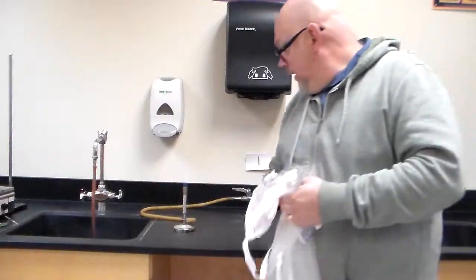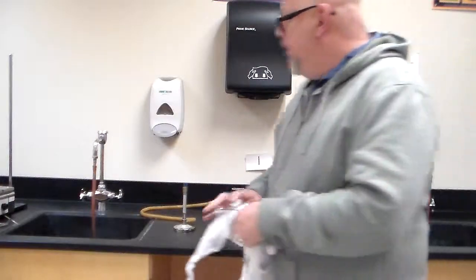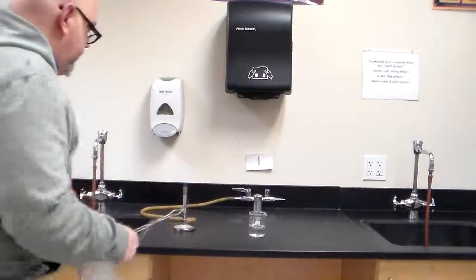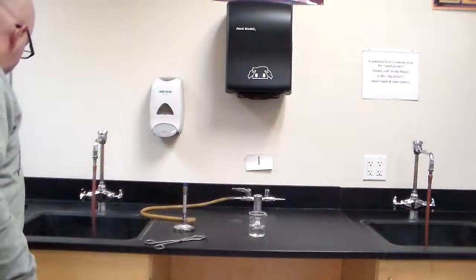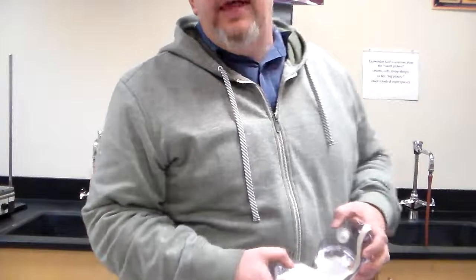One of those things, you're going to have a beaker filled with water. You are going to have a pair of tongs. You are also going to be needing some serious safety gear because we are working with open flame.